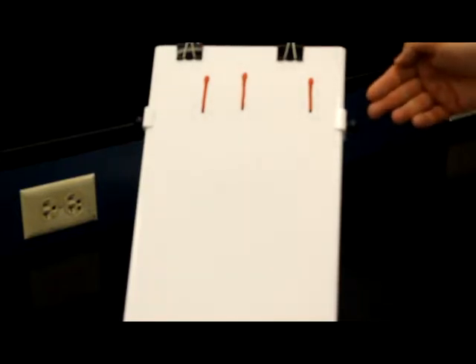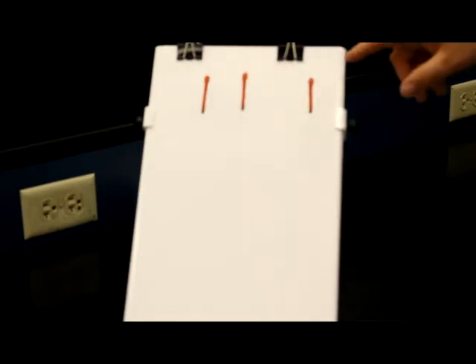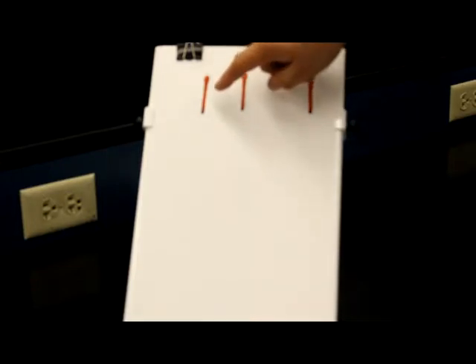You'll notice that you've gone ahead and dropped 3 drops of blood like so. These are at 50 degrees. You're going to want to go ahead and label what angle they were dropped at and the height, which will be 1 foot. And then you're going to want to watch, and you can see that here is your leading edge and here is your lagging edge.